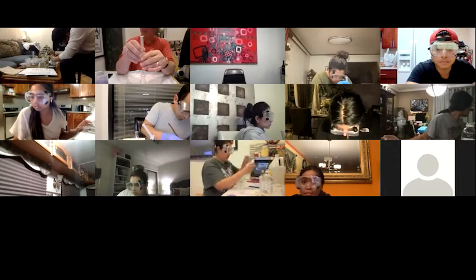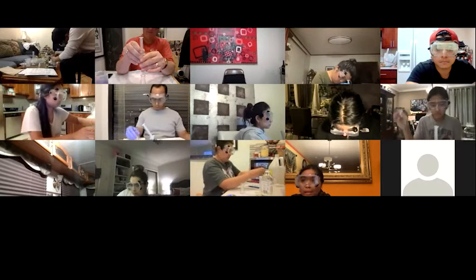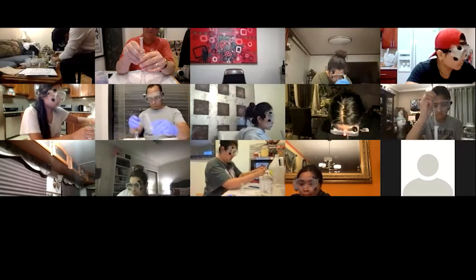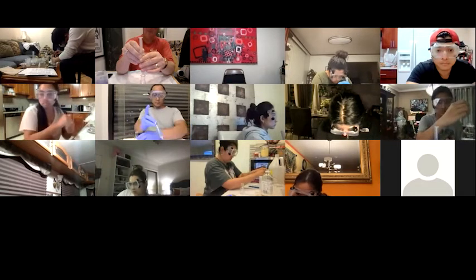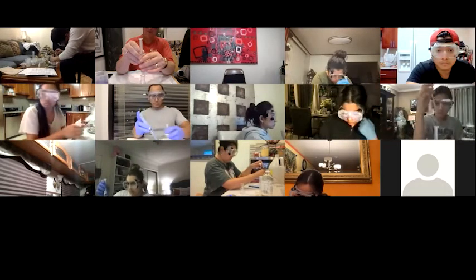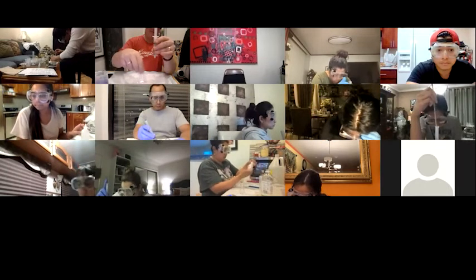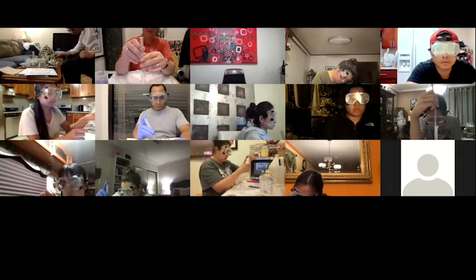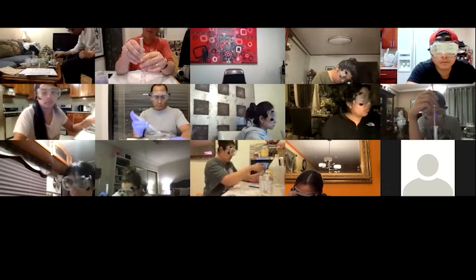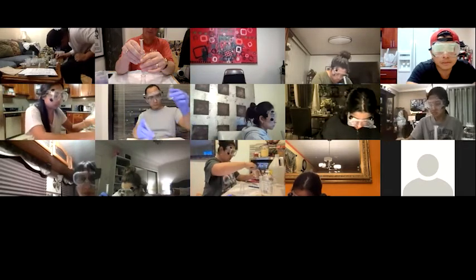I obviously had something in there. Now my color is disappearing completely. Before it was just staying pink. So this should work much better.